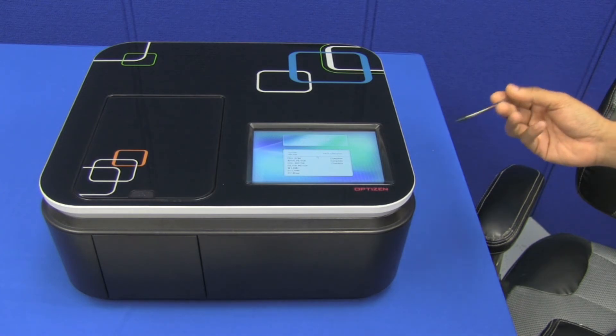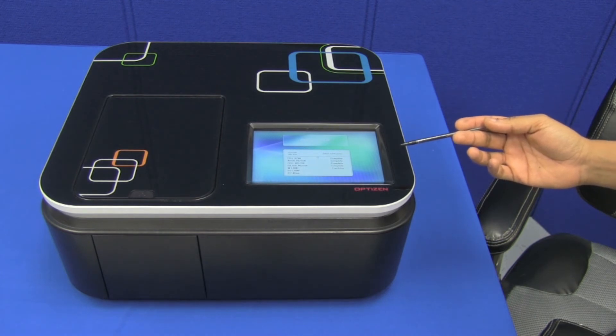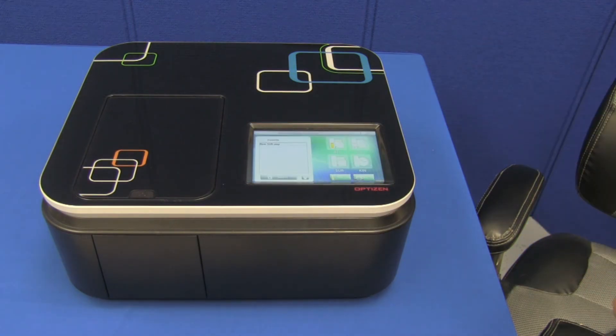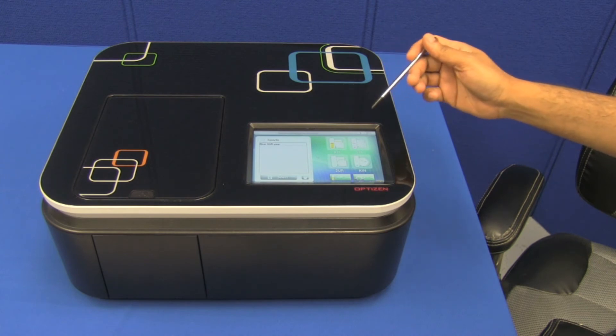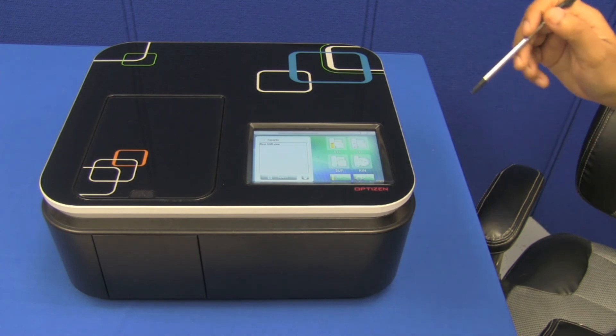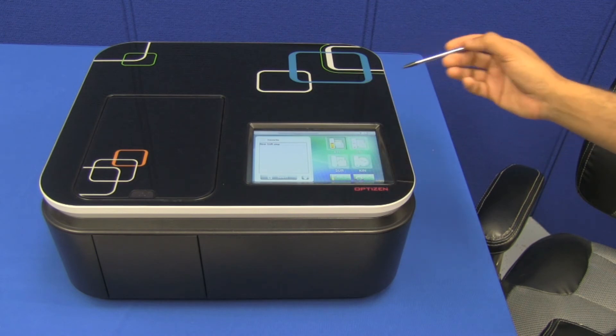Welcome to the world of Optizen. Now, that wasn't me speaking — it was the Optizen Pop. An astonishing feature; I really didn't expect to see something like this — I almost fell out of my chair when it first started talking to me. But it is a really nice feature. The touchscreen interface is your method of communication with the Optizen Pop. It's powered on Windows CE, and you can use it with your finger or the stylus — really convenient.